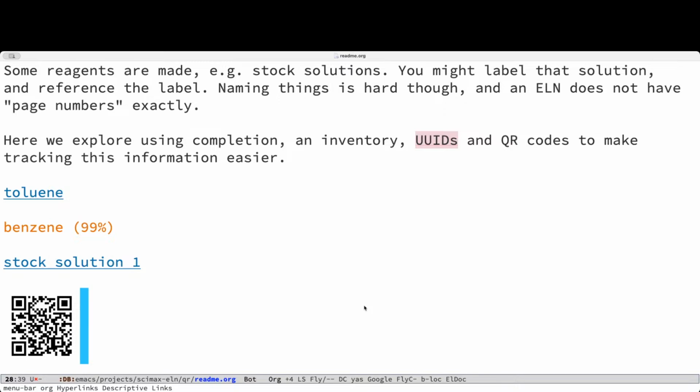And reasonably sure someone in the world, and me eventually, will be able to do that with a Bluetooth device like a Raspberry Pi or Arduino. I think we're a few months away from being able to do that, just because of the amount of stuff I would have to learn about Arduinos. Maybe less time to get it done on a Raspberry Pi.